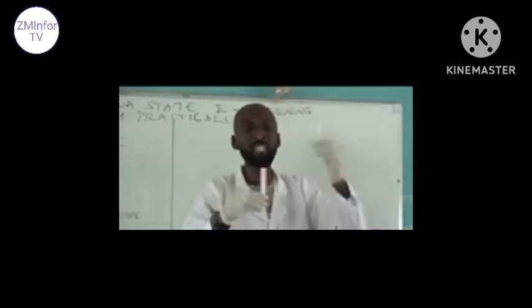And in this regard, as you can see, if you want to pour any liquid in here for measurement, you have to use this funnel. That is where you get it accurately. Then you measure the amount of liquid required. Then you transfer it into another laboratory apparatus known as a test tube.